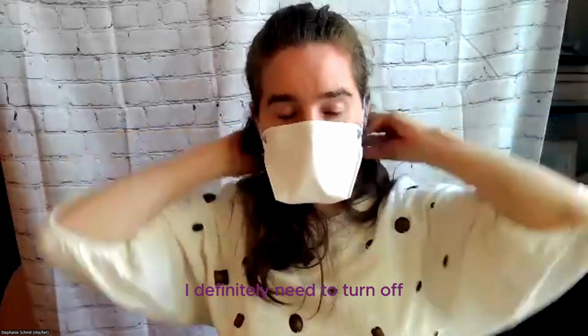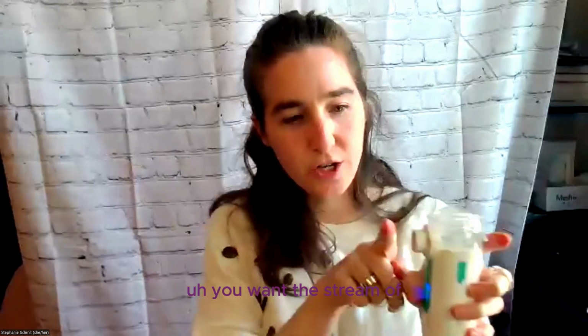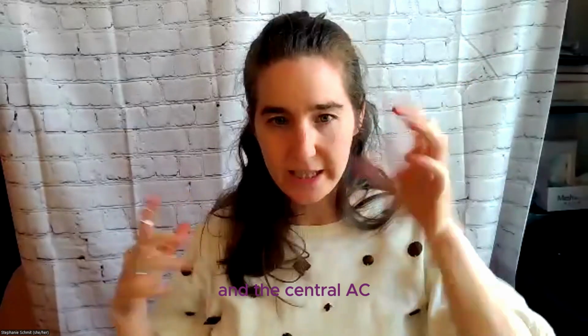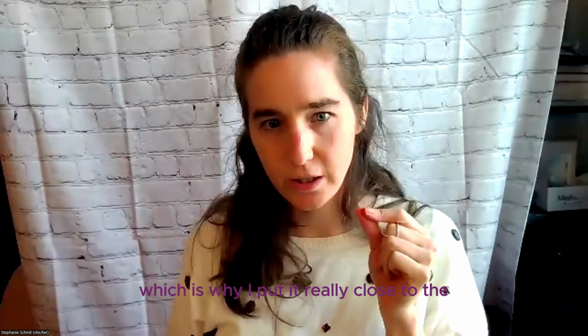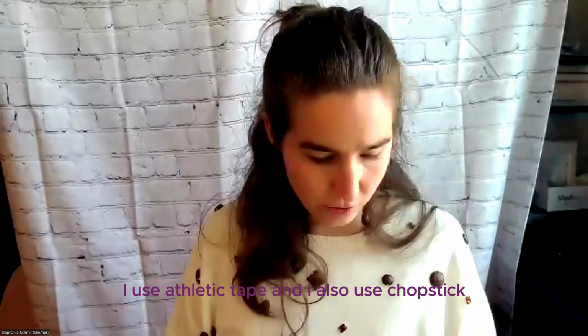I definitely need to turn off your ventilation while you do this, because you want the stream of stuff to go directly into your hood. And I was noticing that because of my air filters and the central AC, it was kind of going the wrong direction, which is why I put it really close to the... Someone asked me about mask tape. I use athletic tape, and I also use Topstick.